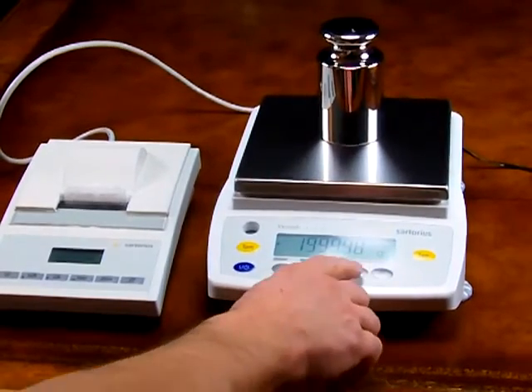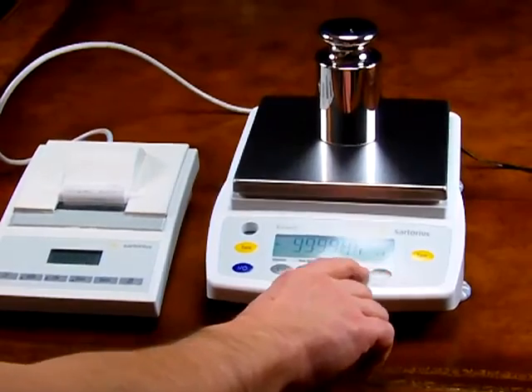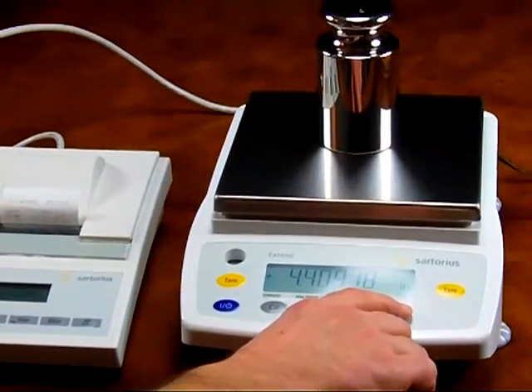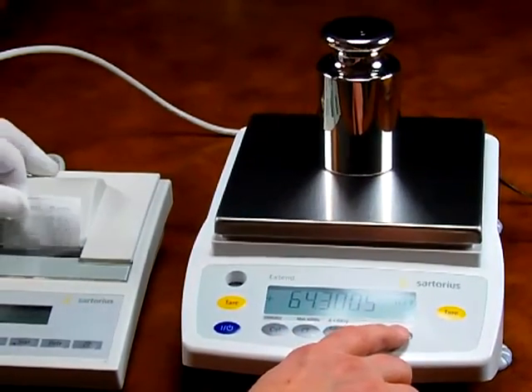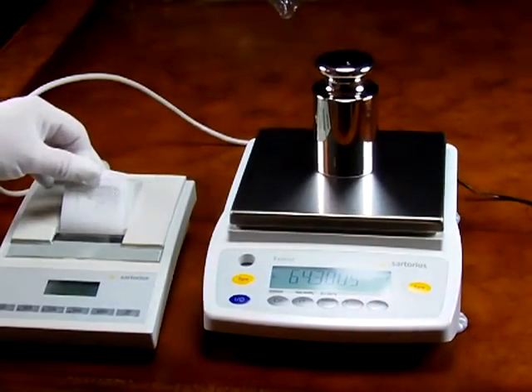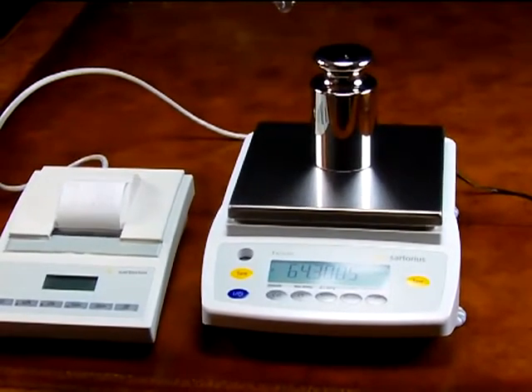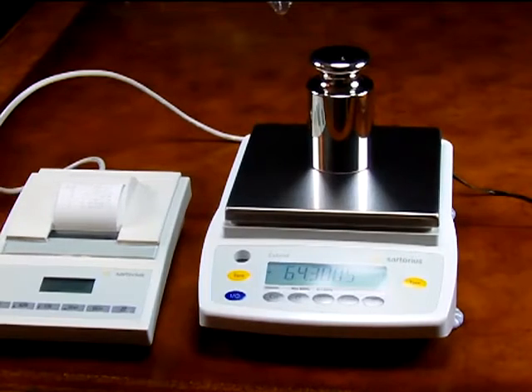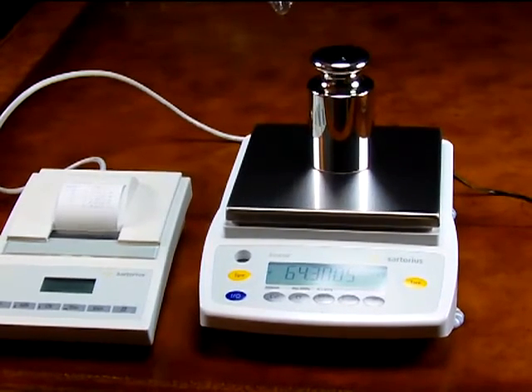We can change the weight modes and you can see here on the display we're showing grams, carats, pounds, and troy ounces. This is the Sartorius GW6202. The balance is always in stock at Precision Weigh and Balance at a fabulous price.